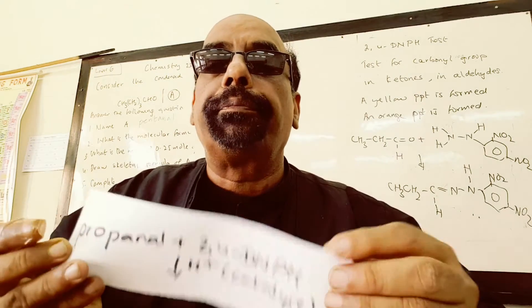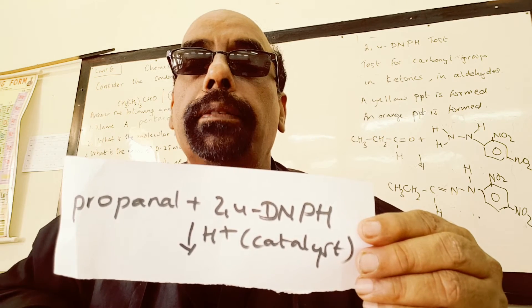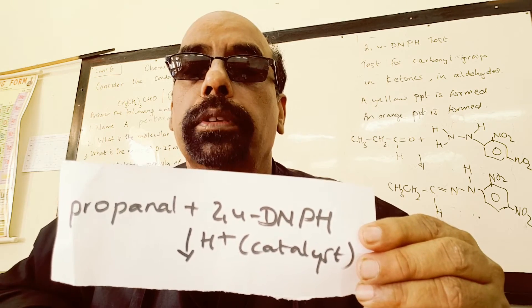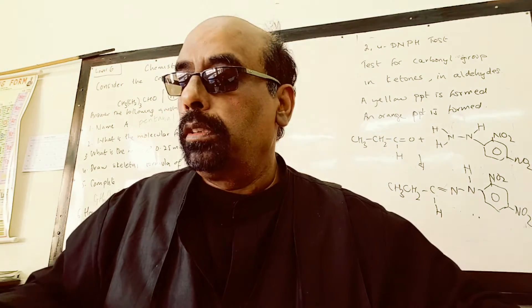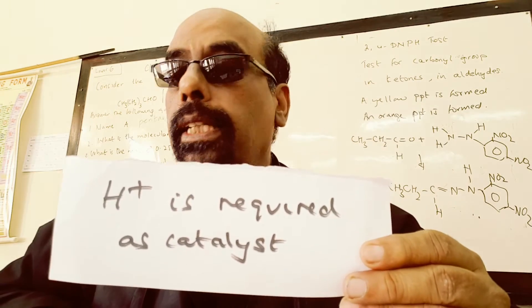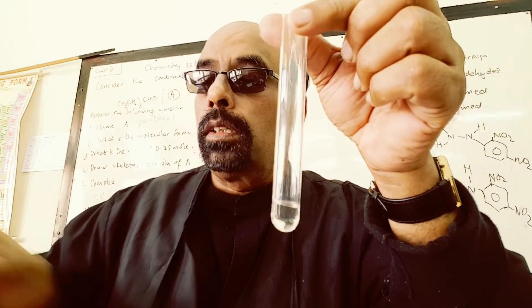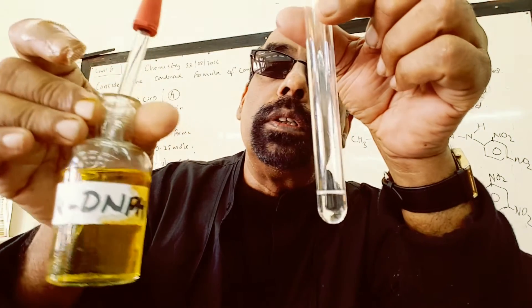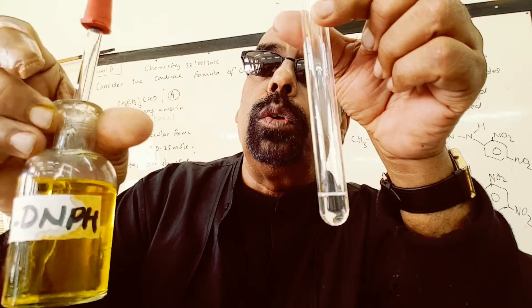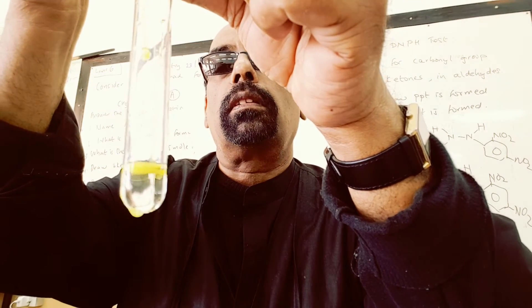When 2,4-DNPH is added to propanal, a yellow precipitate is formed. A small amount of acid is required as a catalyst. I have propanal here, and I add 2,4-dinitrophenylhydrazine. A yellow precipitate is obtained.